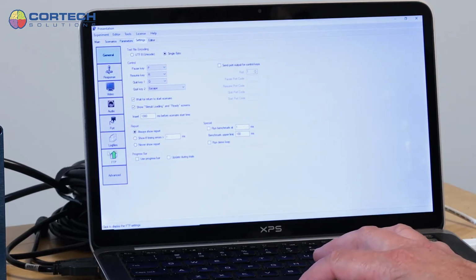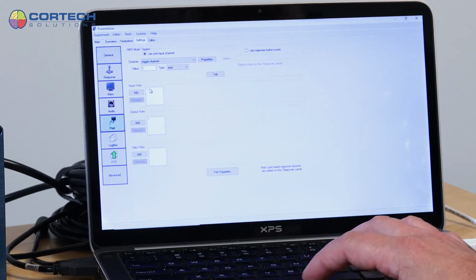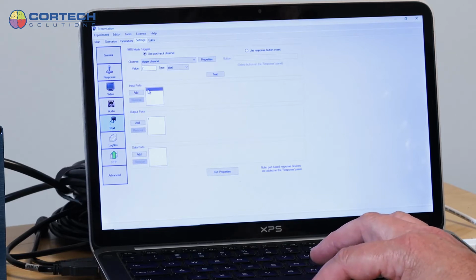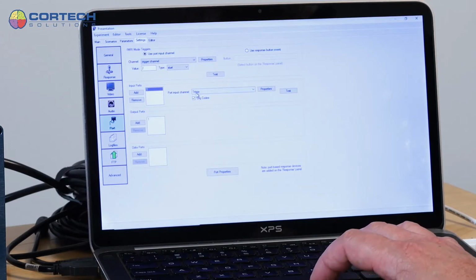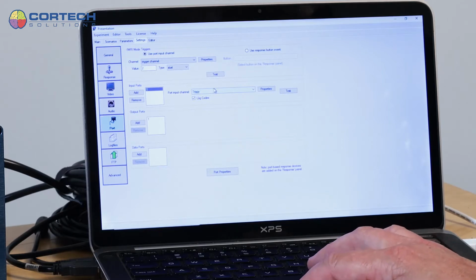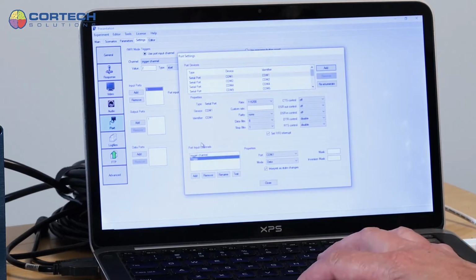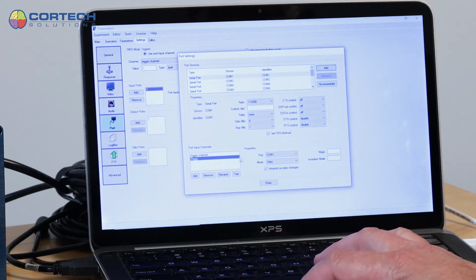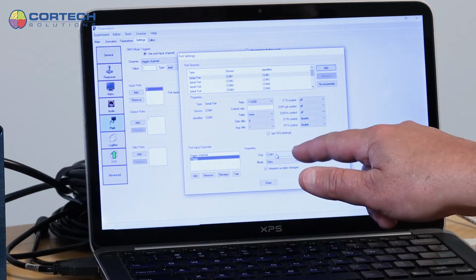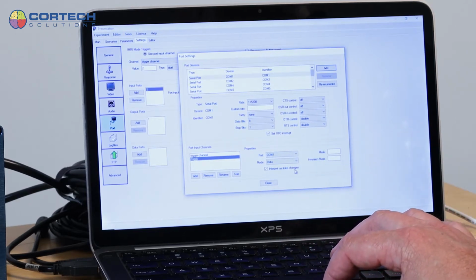And the first thing I need to do is create a port that is an input port. I've already done it. And assign it to an input channel, or the reverse, assign an input channel to that input port. So I created this input channel on this screen at the bottom where it says port input channels, and created one called Triggy, and it is tied to a COM port, COM1, and the mode is data. Interpret as state changes is enabled.